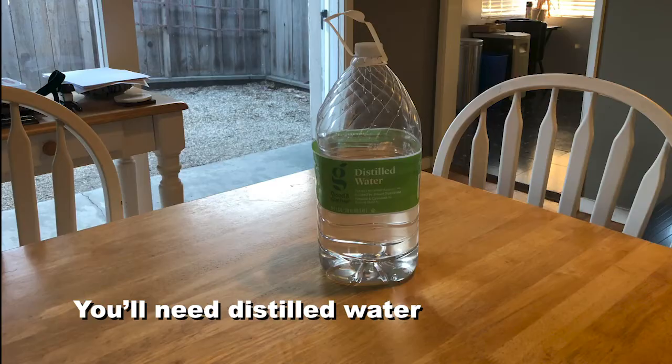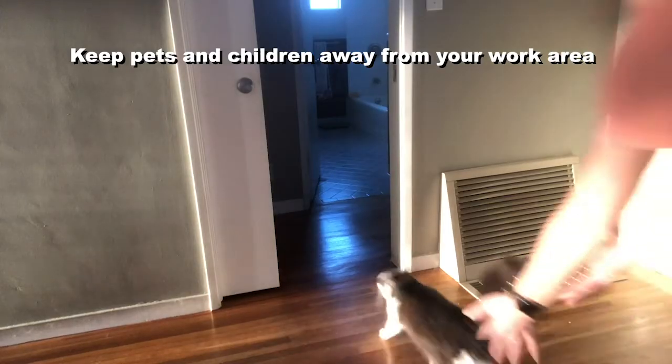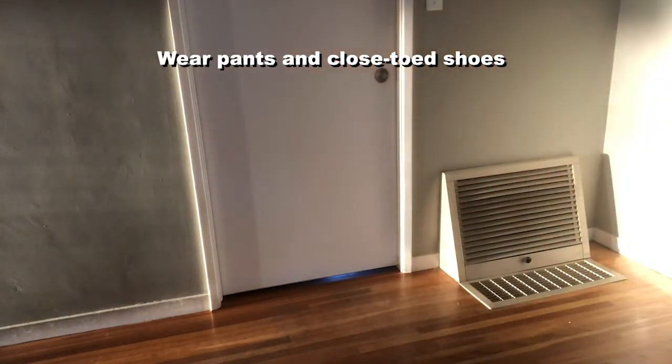Before you get started, you're going to need some distilled water for this experiment. Iodine stains, so protect your work surface with a tablecloth and wear old clothes or an apron. Keep pets and children away from your work area and wear pants and closed-toed shoes. And always wear goggles.